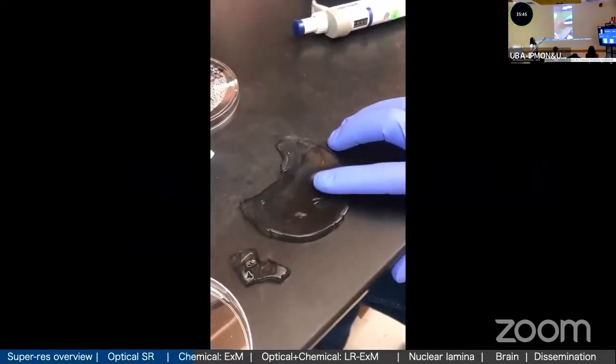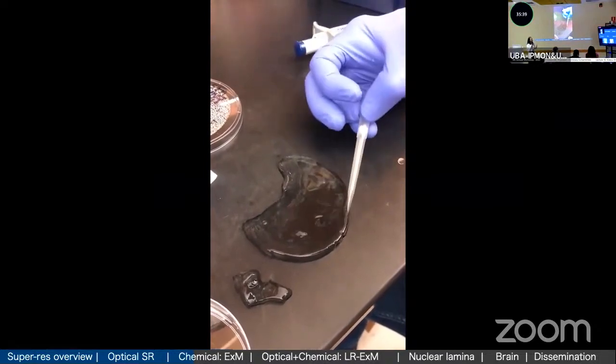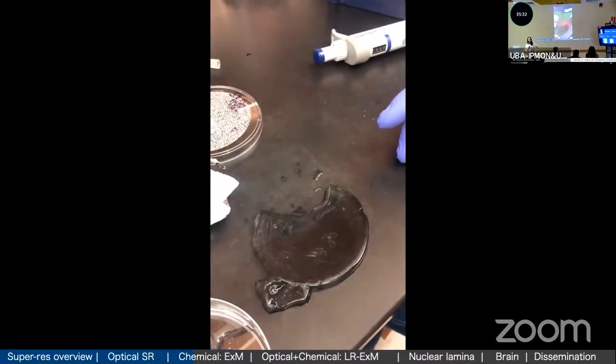And this is the hydrogel. They are semi-firm, semi-runny, like 95% water. But what's inside of the transparent hydrogel is your tissue and cells. They're at the bottom of the hydrogel, but still a part of the hydrogel. And of course, you should not put your hydrogel on the bench without a petri dish. This is just for show, but there are real tissues inside, but they are transparent. You won't be able to see them after expansion.